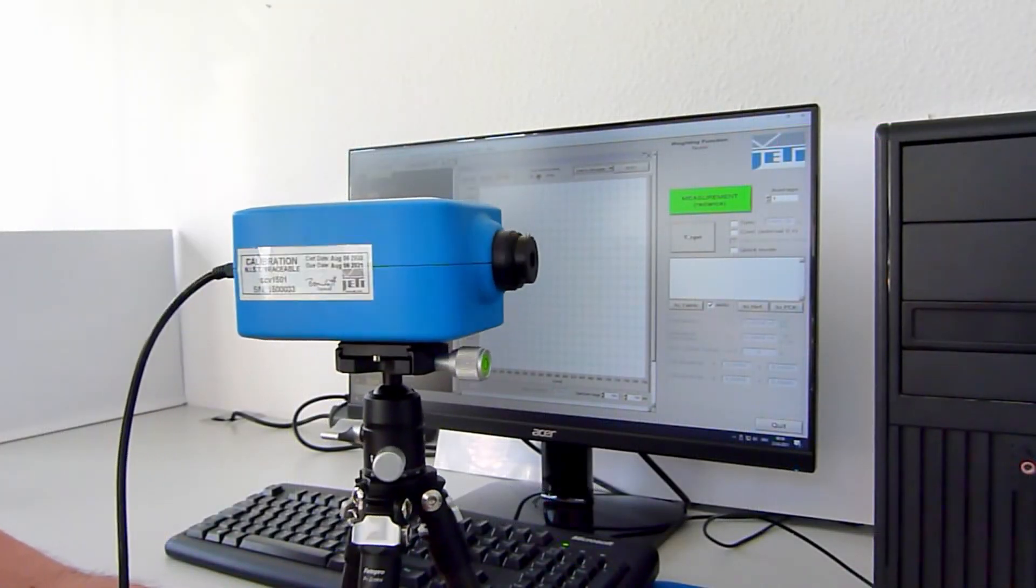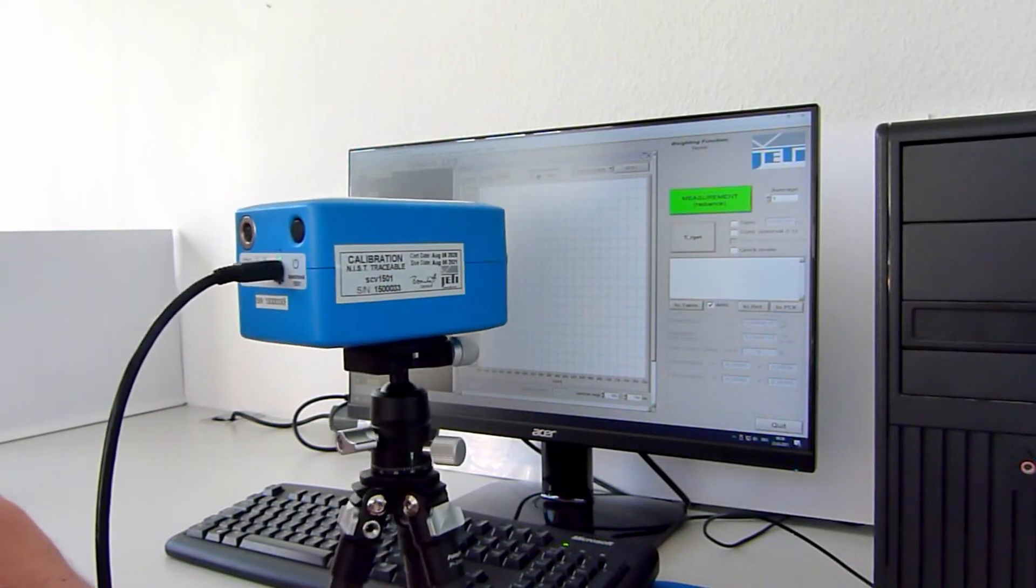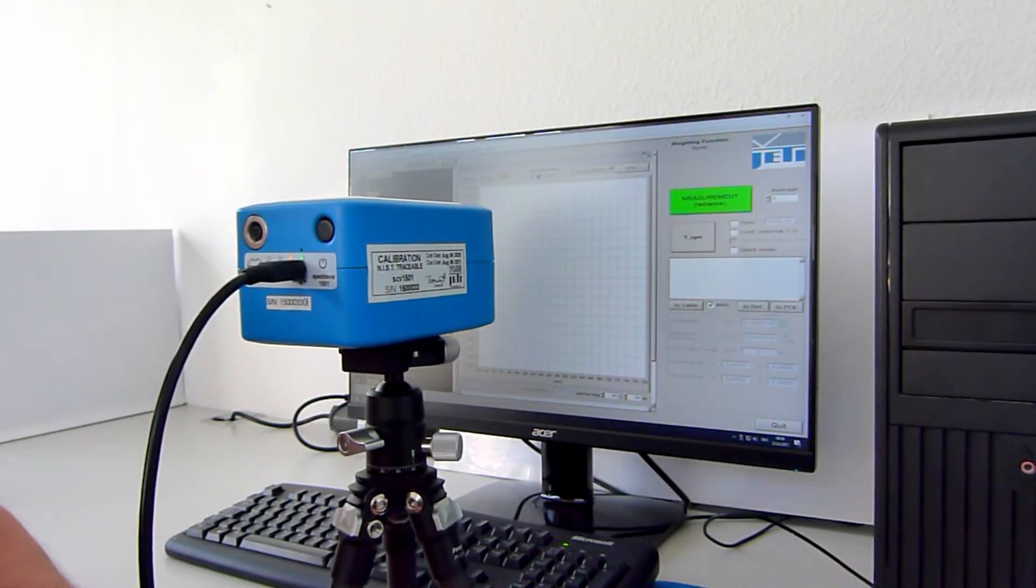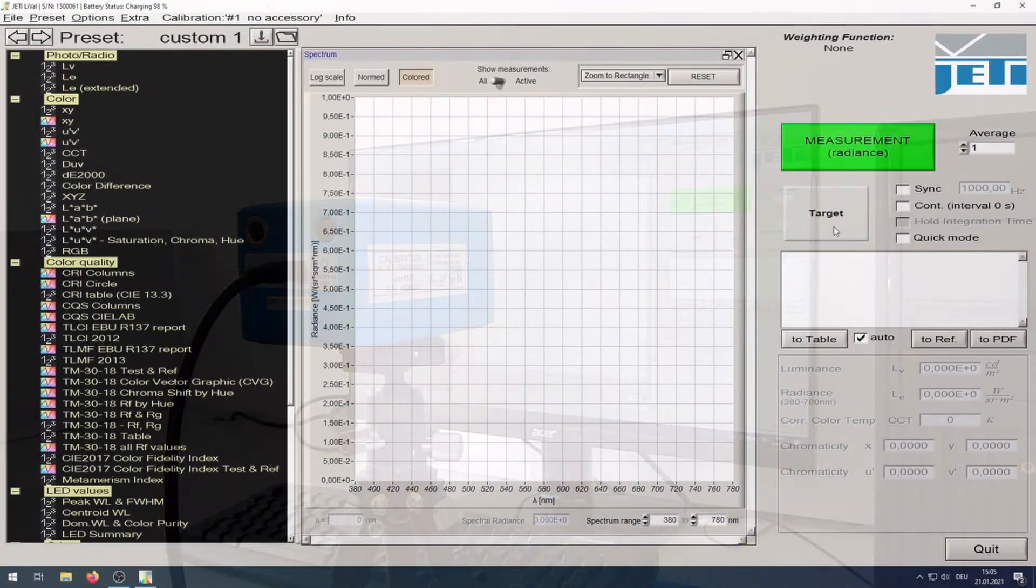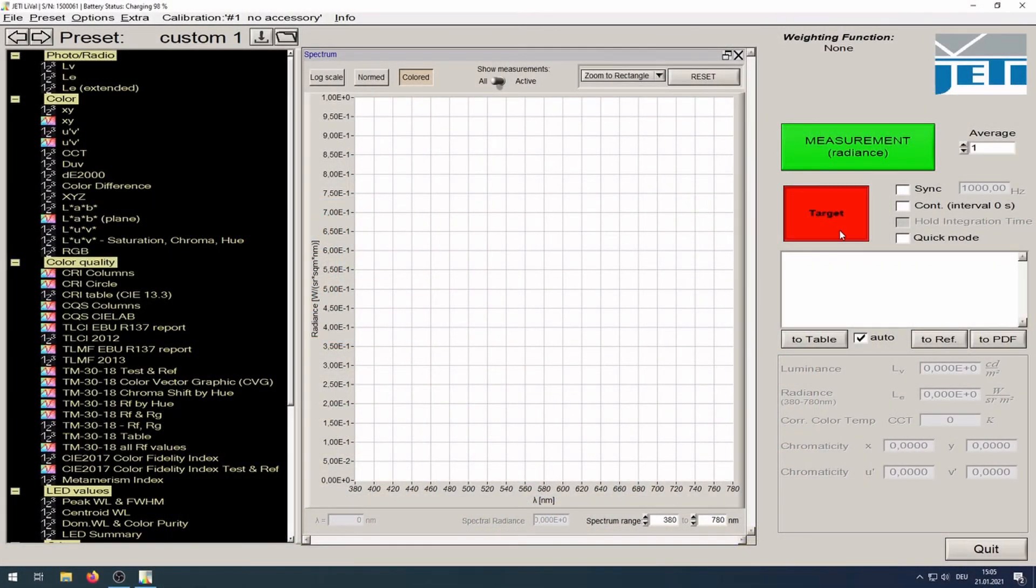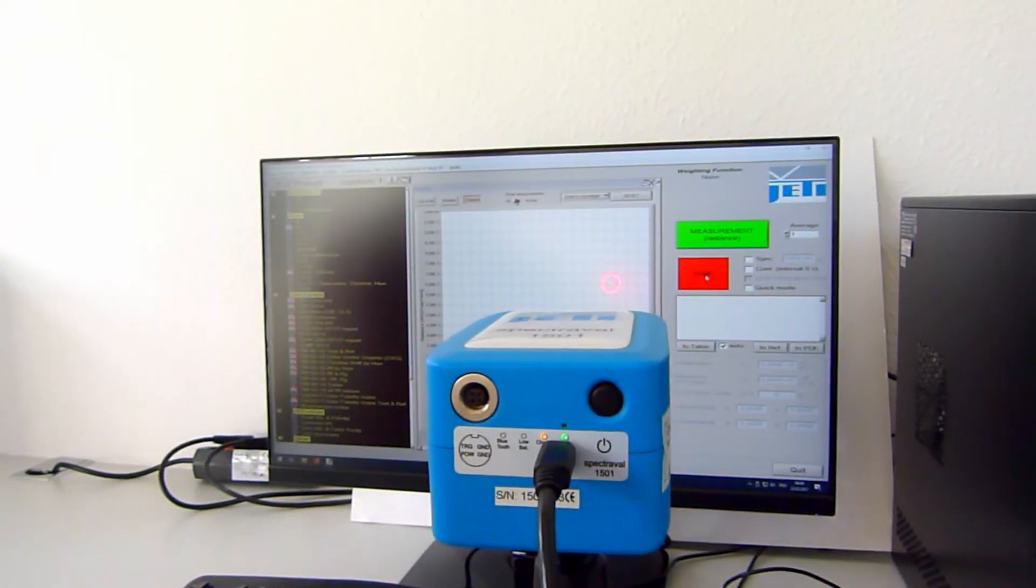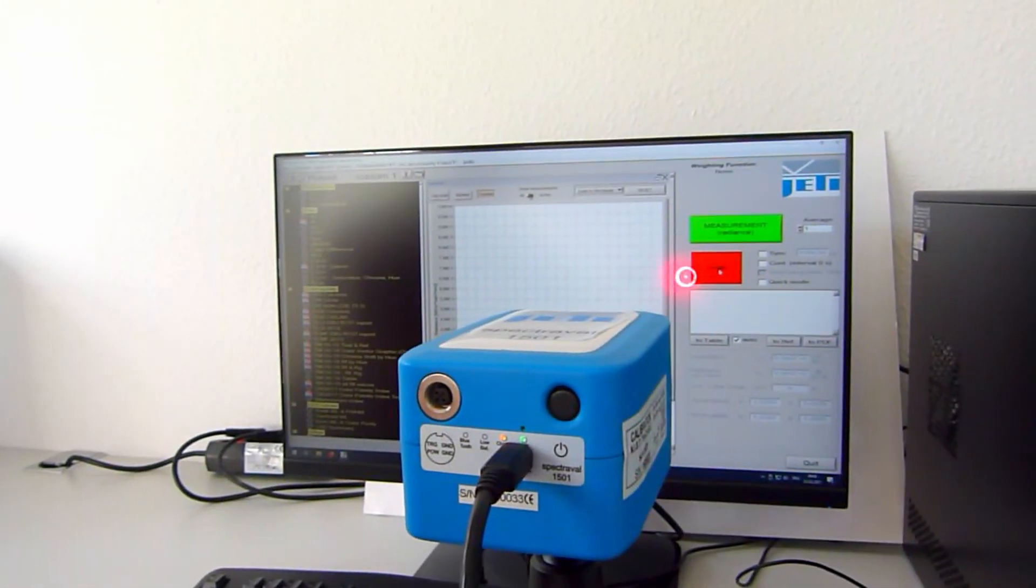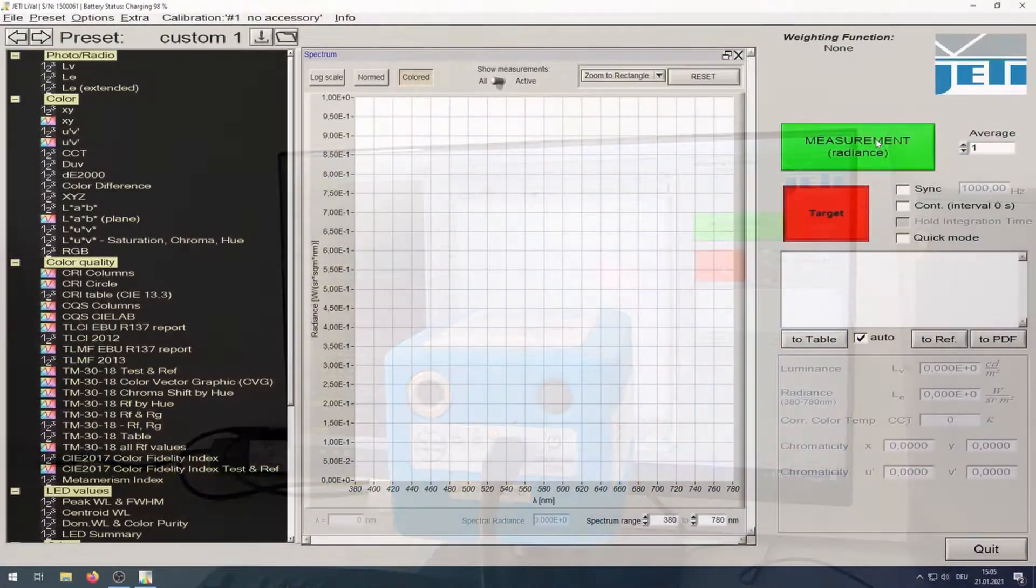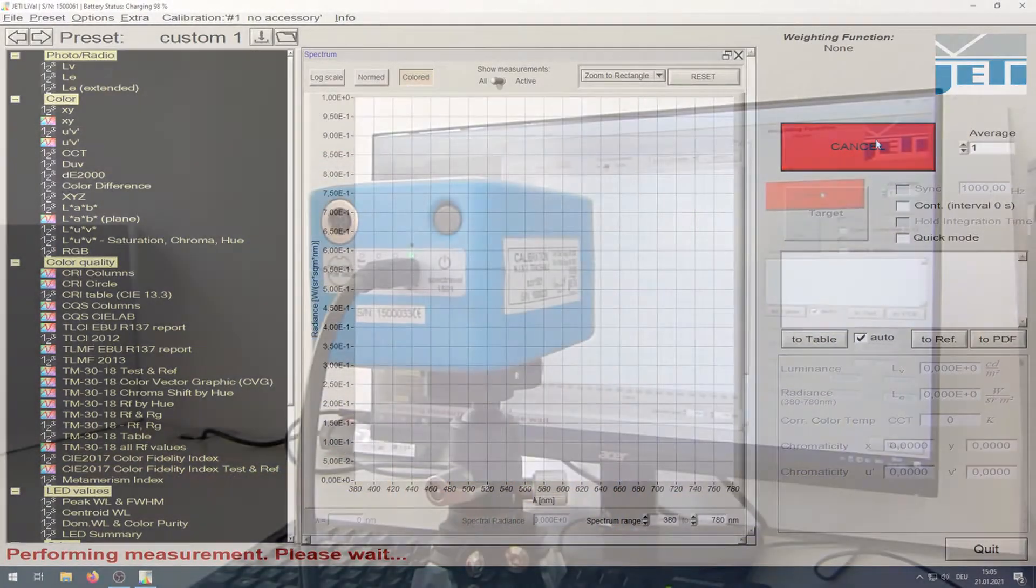Do not look into the beam with optical devices like telescopes or collimator lenses. Click Target Button and adjust the instrument viewing. Click measurement button to start the measurement.